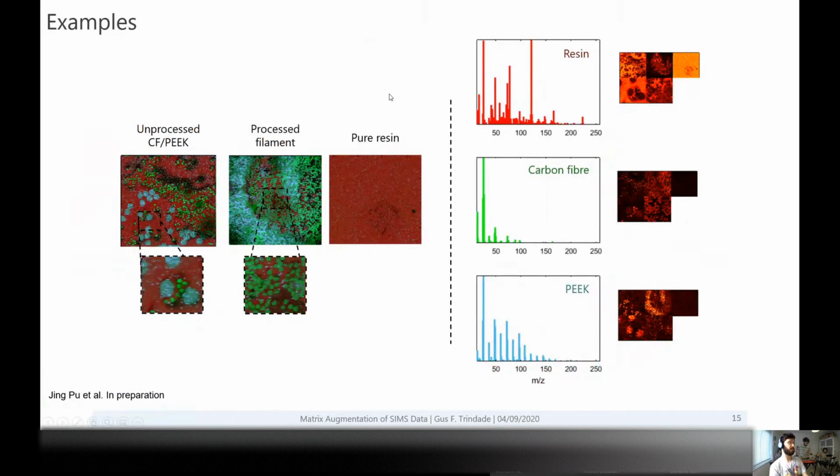So here, for example, we're working with this filament. We're making a filament that's based on 2 different kinds of fibers. It's a composite material. So we have the polymer fibers, the carbon fibers. In green is the carbon, and in blue here is the polymer. We made a cross section, embedding everything in an organic resin, and then cutting.